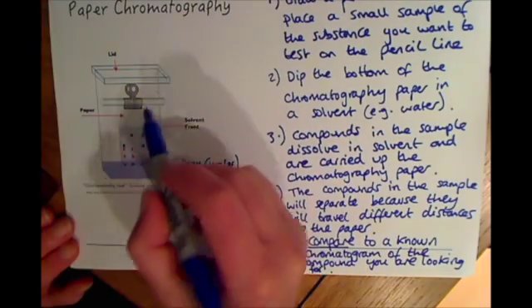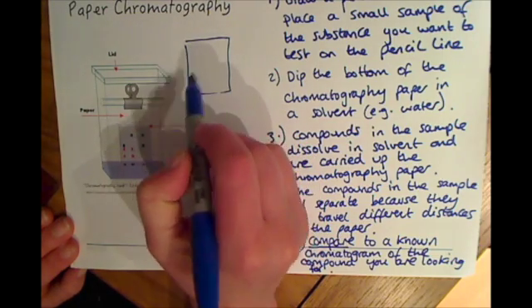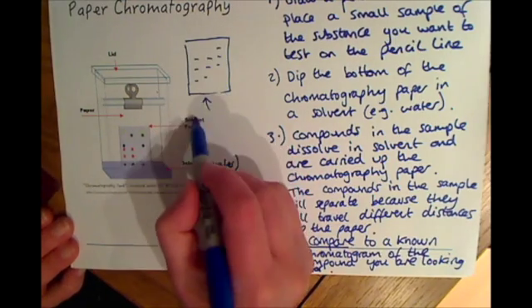Once you've got your piece of paper out and dried with your samples spread out, we then call this a chromatogram.